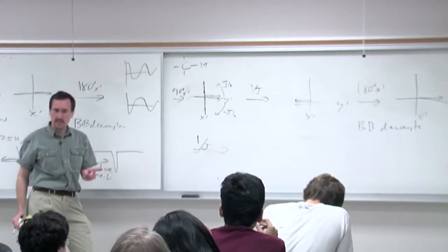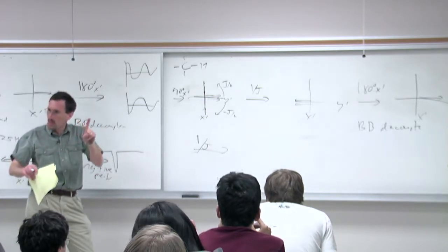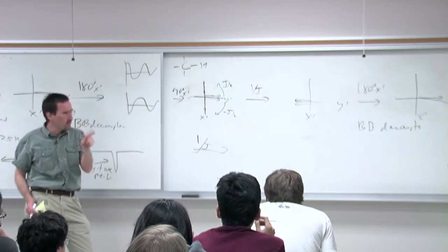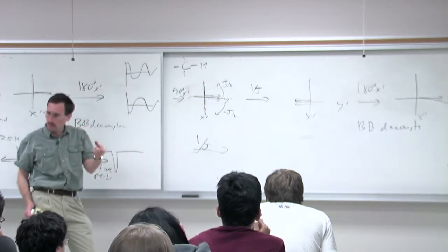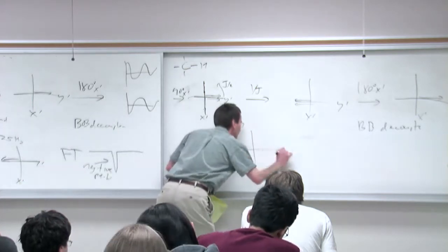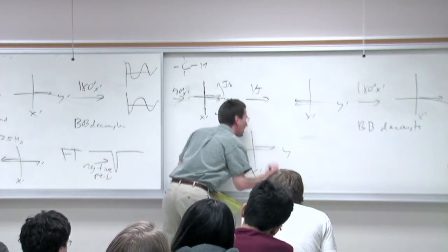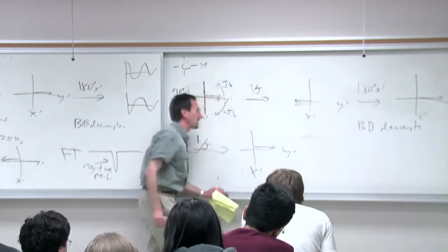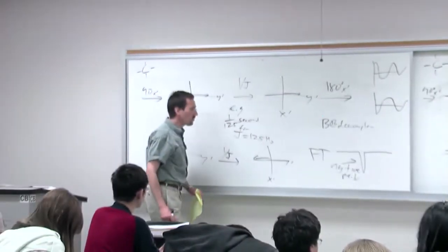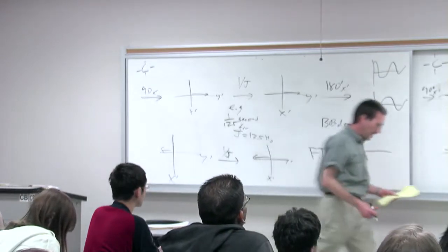Except, remember what I said about T2. Remember what I said about defocusing. The reason you're doing this is to refocus any inhomogeneity in the spins due to T2 relaxation. But nothing changes in regards to this primary picture. Now you're decoupling. Your magnetization is still along the positive y-axis. And so at this point, when you observe, what do you get? You get a positive peak.